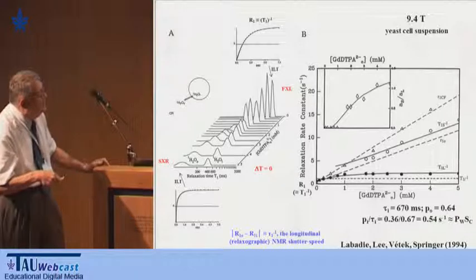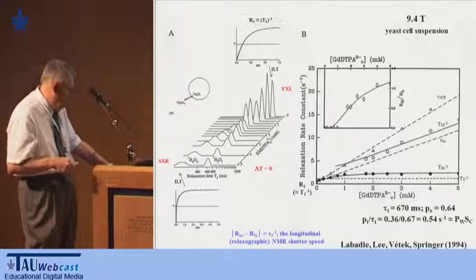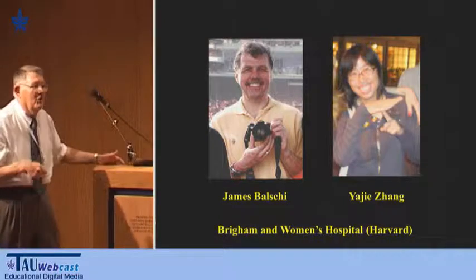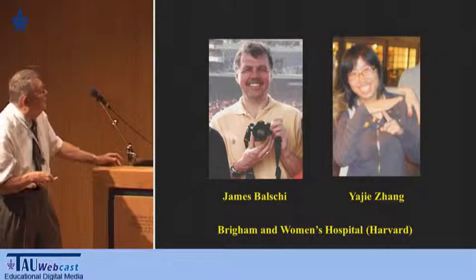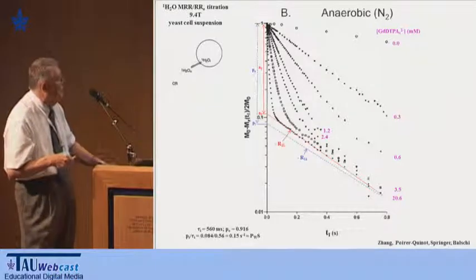And here 16 years ago, we learned the average lifetime of water inside the yeast cell was 670 milliseconds. And with this suspension, 64% of the water was on the outside. Well, Jim Balshai, shown here at Fenway Park, decided a few years ago to really do this right, much better than the way we did it 16 years ago. And we hired Yaji Zhang. And they have done fantastic and really discovered something really very interesting.